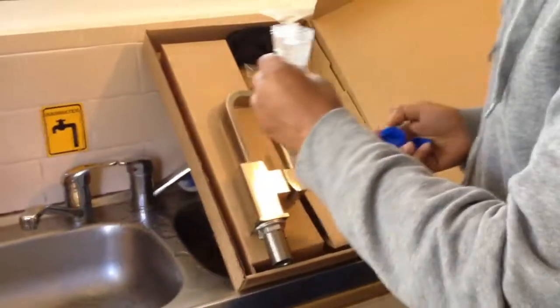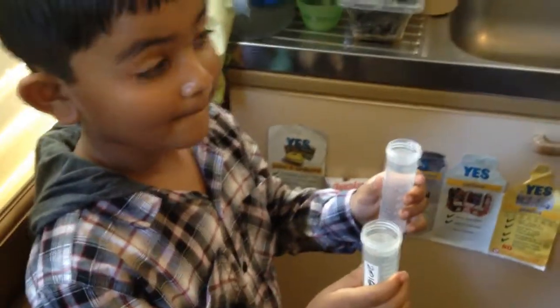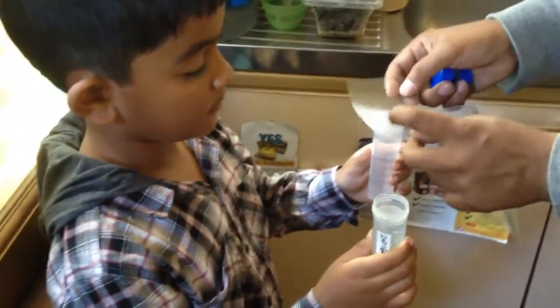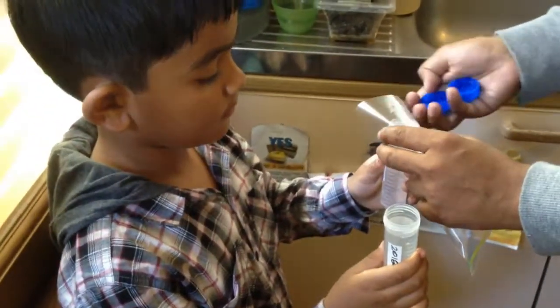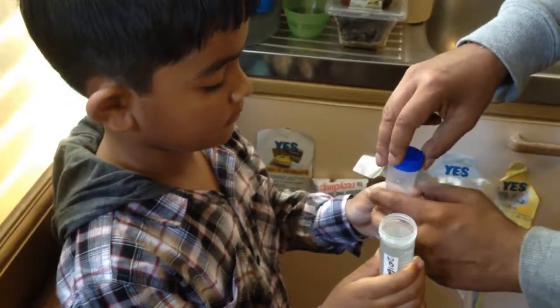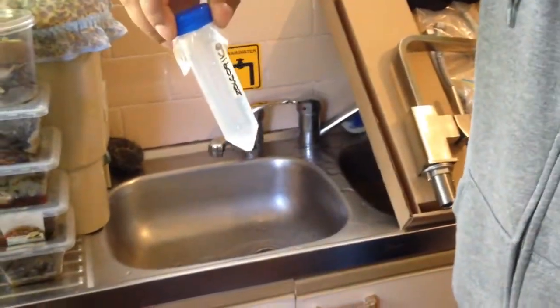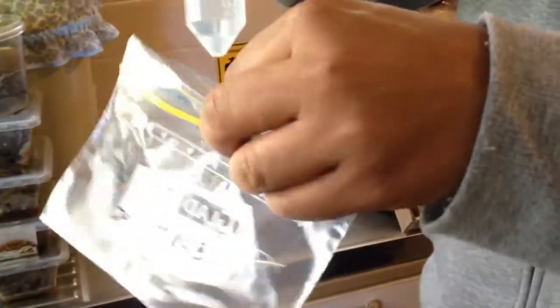Now I have to seal it with a plastic — this little plastic that goes on top. You can see this is number B, so it will go inside the number B plastic wrap. Seal it properly. Now that's number A, sealed the same way.